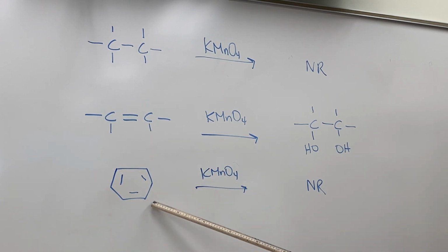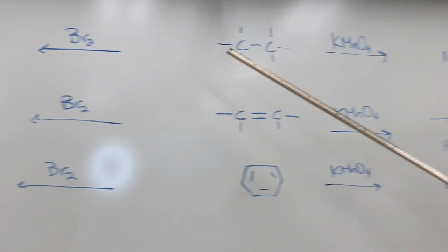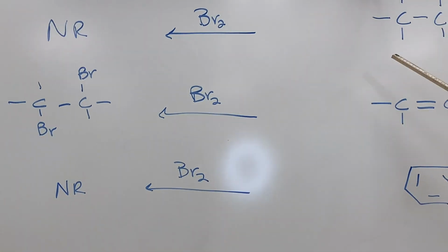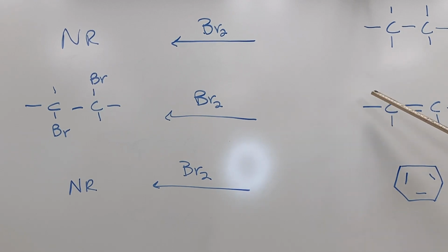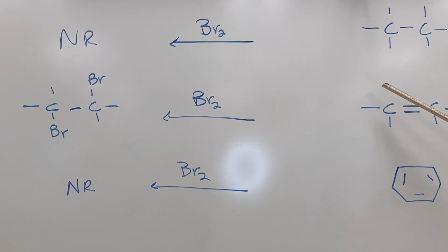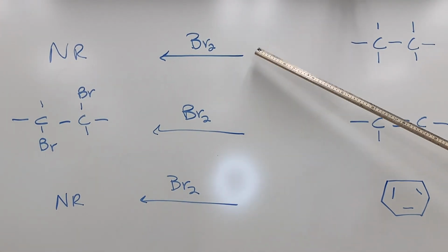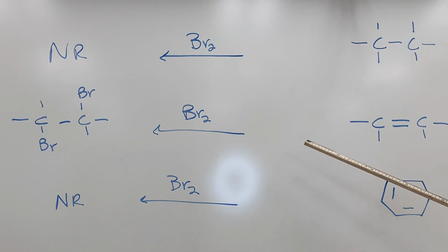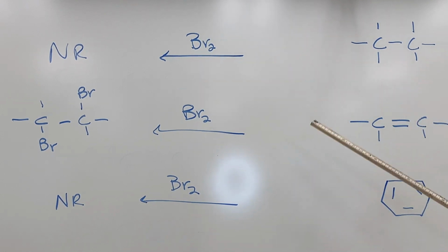usually makes that aromatic ring unusually stable. So the two reagents that we're going to use today would be bromine, and your textbook or lab manual calls for pyridinium bromide perbromide, typically because it's less toxic than bromine dissolved in some type of nonpolar solvent. Ours will most likely be in dichloromethane or cyclohexane. I'm going to use bromine and not the pyridinium bromide perbromide. You still get the same results. I'm going to use bromine instead.